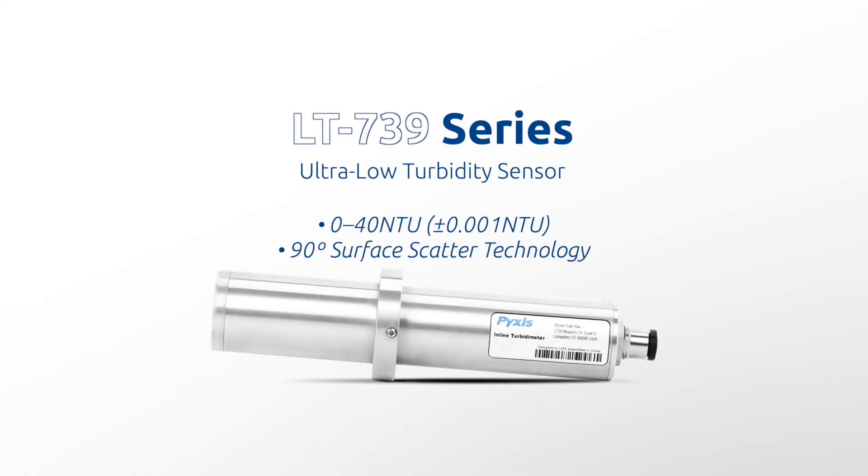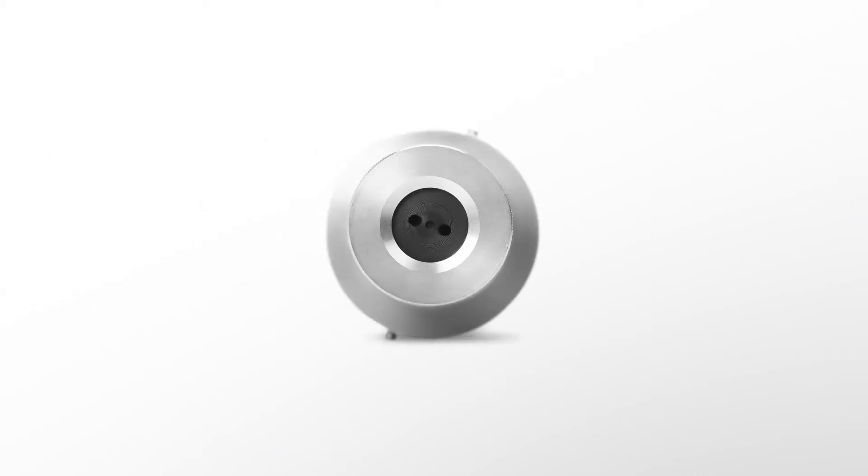For ultra-low turbidity, the panel incorporates the LT739 sensor. This stainless steel sensor may be selected in both warm white light for US EPA and infrared for ISO 7027 compliant application needs, and offers a wide range of detection from 0 to 40 NTU with a resolution of 0.001 NTU, using 90-degree surface scatter configuration technology and a flat distillate quartz sensor window.